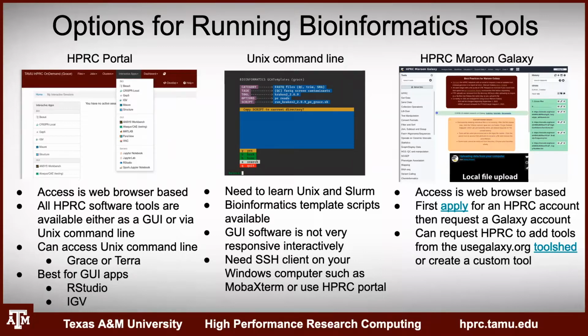Yeah, so I'd really recommend that. There are also command line courses available through more traditional means. I know Chris Blazier is a teacher that covers command line, as well as several other bioinformatics classes. But in order to do this, you need an SSH client on your computer. So if you're using a Mac, you can just use terminal.